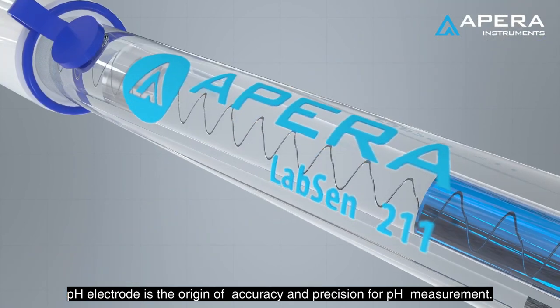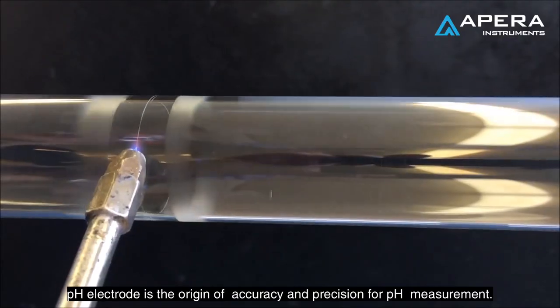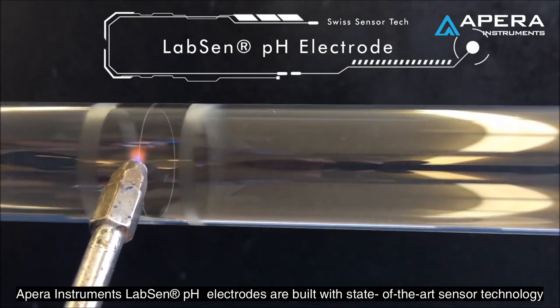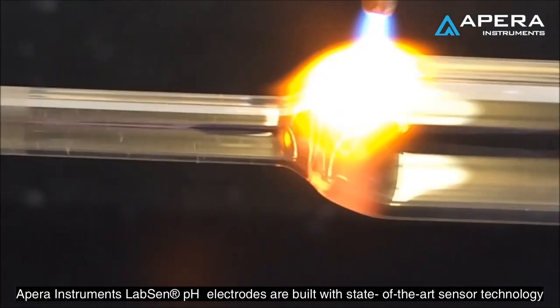The pH electrode is the origin of accuracy and precision for pH measurement. Apera Instruments LabSen pH electrodes are built with state-of-the-art sensor technology and manufacturing techniques from Switzerland.